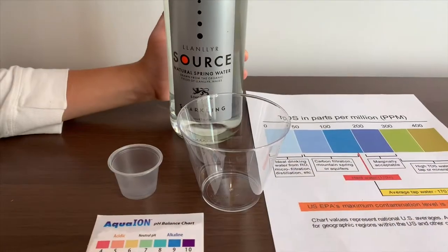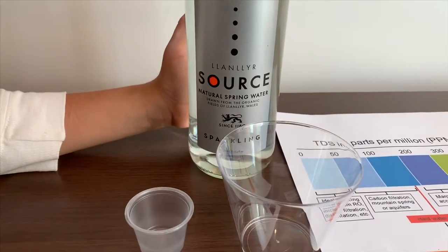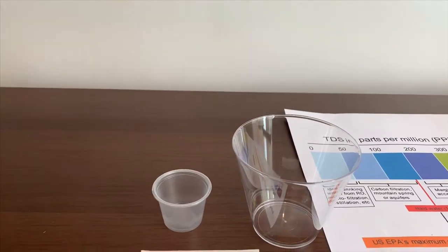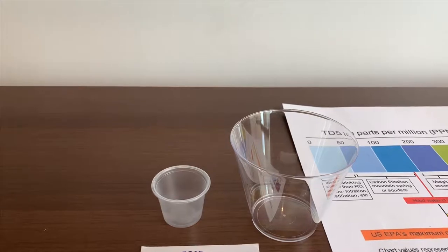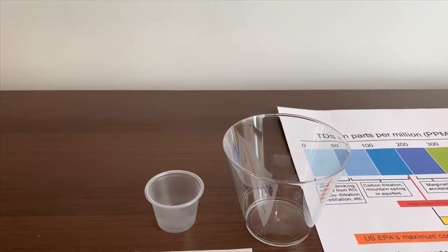This is Llanllyr Source Natural Sparkling Spring Water from Wales. Let's open it — it costs $3. Let's open and see the TDS and the pH levels.